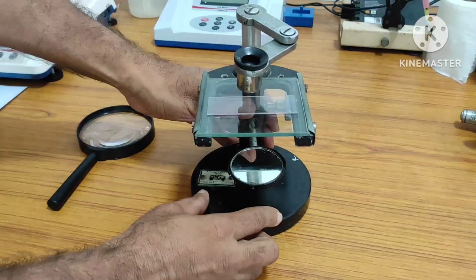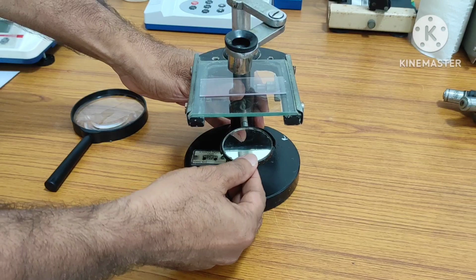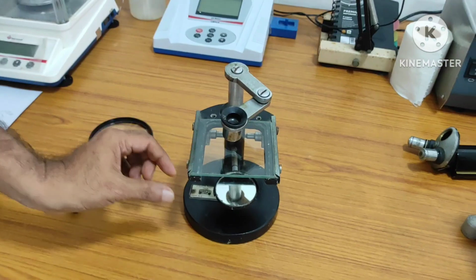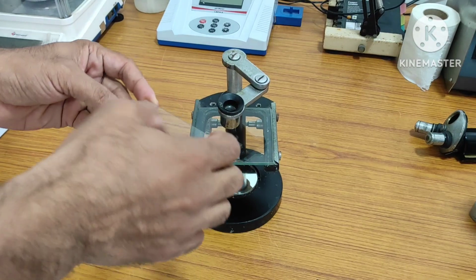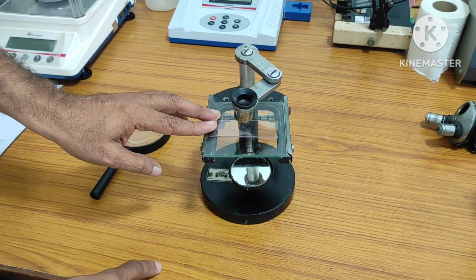Only natural light can be used. Light falls on the mirror, is reflected, and passes through the stage. This is the mirror, this is the stage, and over the stage we put our slide, and over the slide we put the specimen which we want to observe under the microscope.